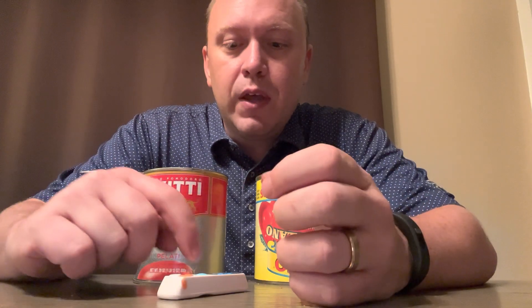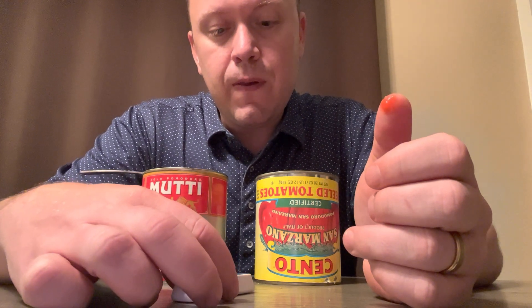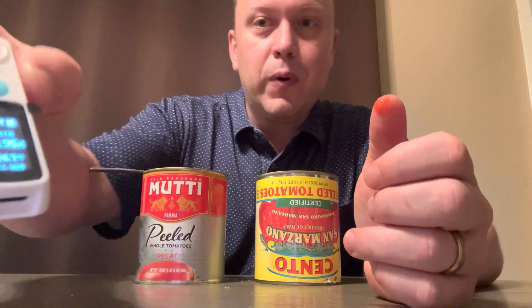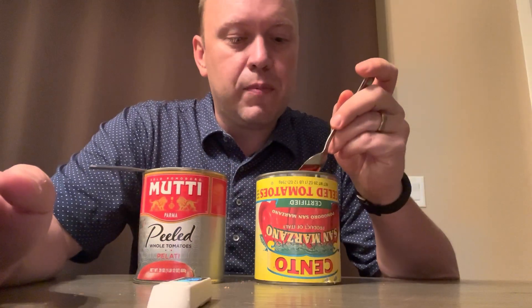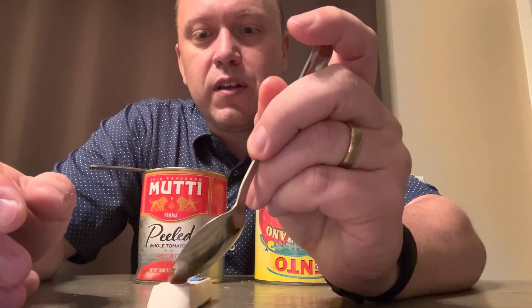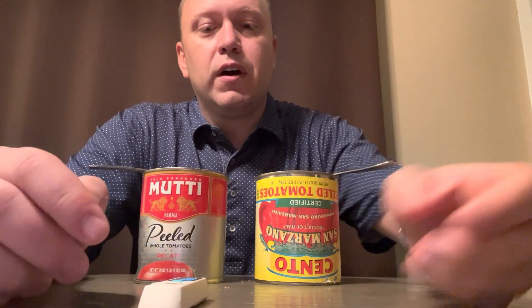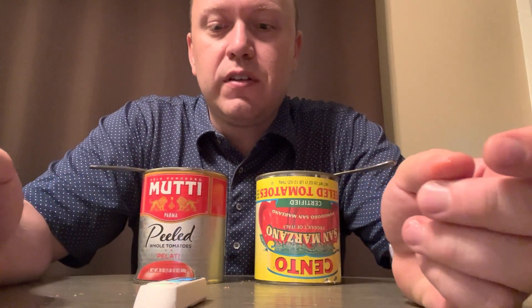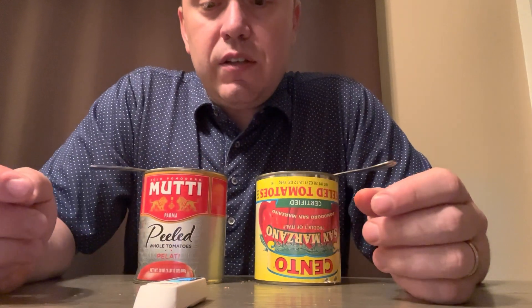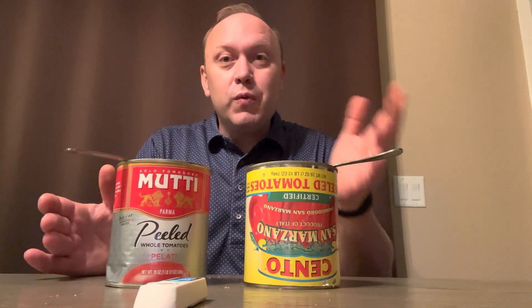We're going to cover that and then go for the reading. The reading comes out at 5.95%. We've calibrated it, and now we're going to put this — we'll call it a solution, really it's tomato sauce slash juice — across there and run the test. This comes in at 5.25%, very similar readings.